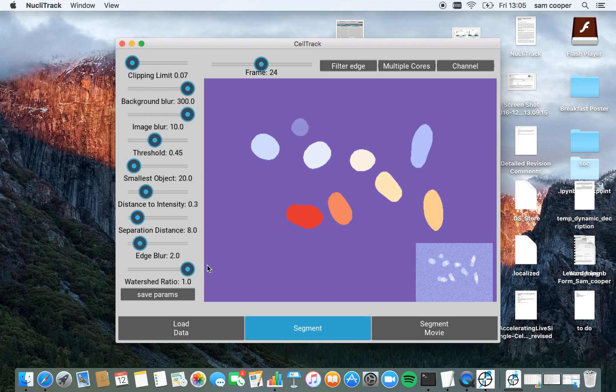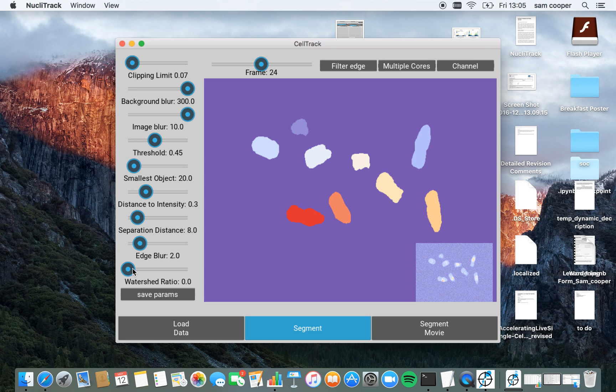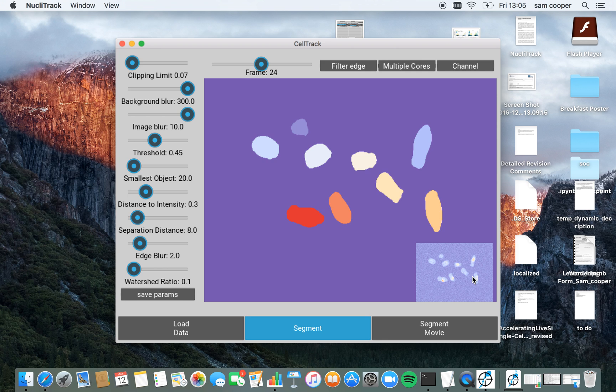So high value here leaves some larger segmented areas than a low value. I'm going to go for about 0.05 here, as this seems to match the image in the bottom right corner quite well.